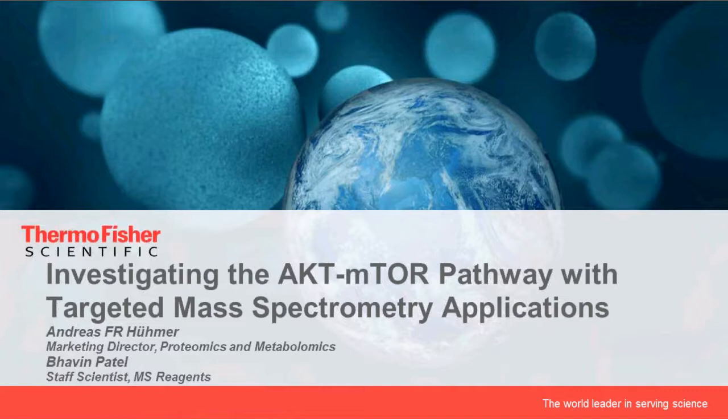Today we are presenting a webinar entitled Investigating the AKT-mTOR Pathway with Targeted Mass Spectrometry Applications.